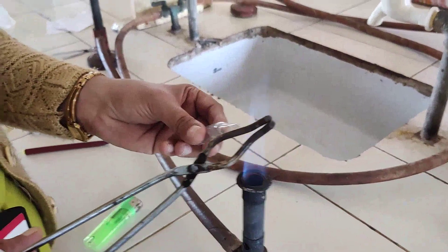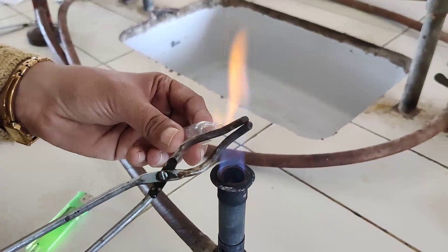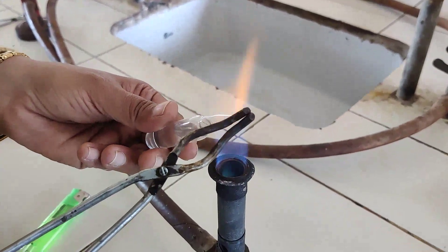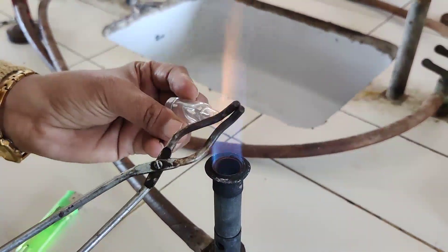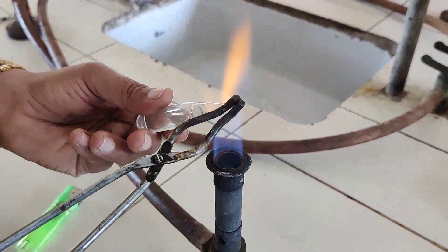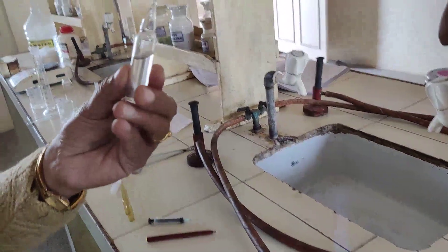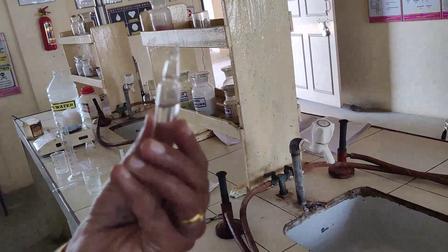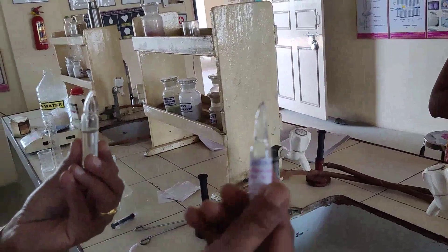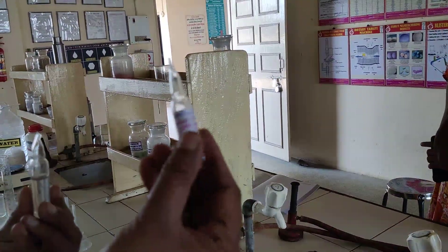After sealing, press the tip, because during packing if the tip breaks the ampule will leak. By pressing the tip in this way, the ampule gets sealed by the pull sealing method. After that, label the ampule — write 'Normal Saline Solution' along with all required label information.